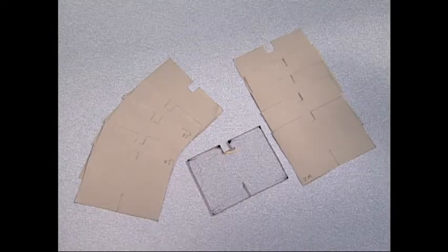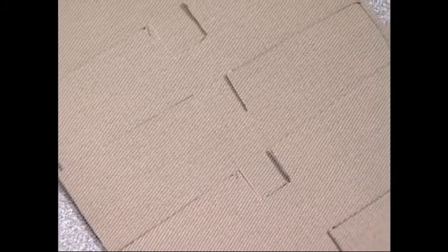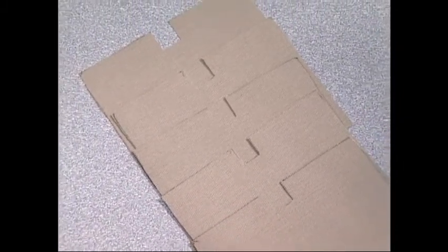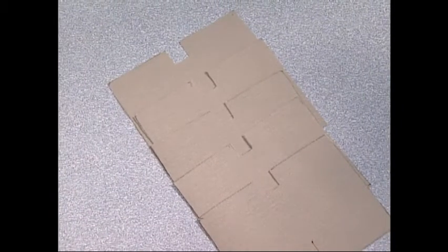The Elmendorf tear test method covers the determination of the force required to propagate a single rip tear starting from a cut in a fabric and using a falling pendulum apparatus. It uses a smaller specimen than the tongue or trapezoid tests with a shorter slit in the center of one long side. ASTM test method D1424, test method for tear resistance of woven fabrics by falling pendulum, Elmendorf apparatus.